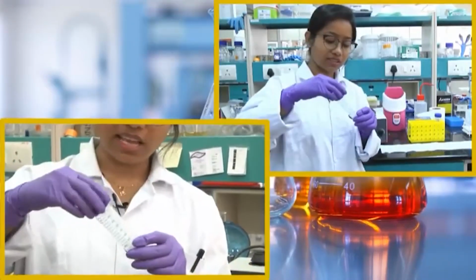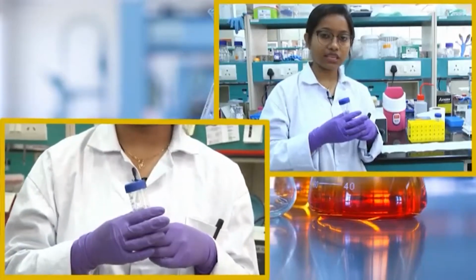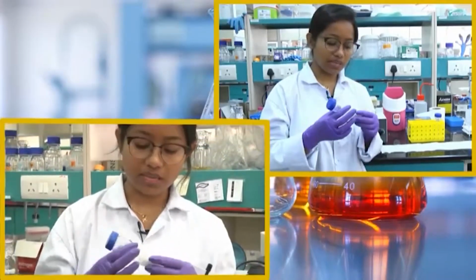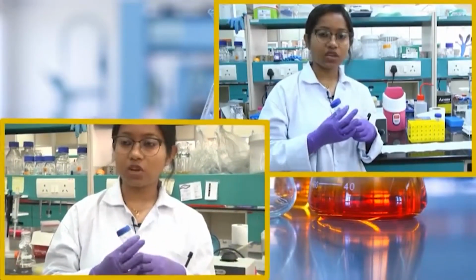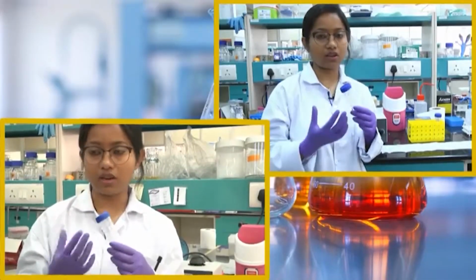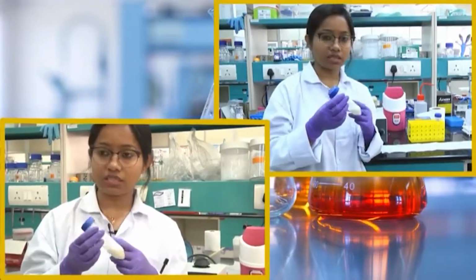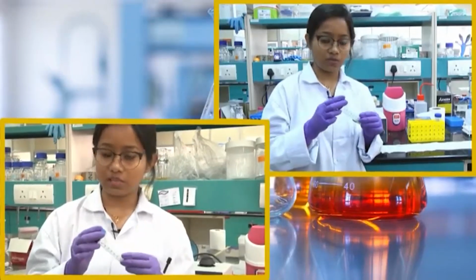Because after the lysozyme lysed the cells, all the cellular components, including the DNA and RNA, come out from the cell, or mainly the nucleus. The DNA is a highly negatively charged and quite large molecule. So those DNA molecules make the solution a lot more viscous, and they try to stick to the wall of this Eppendorf tube, and that is how you know that the cell has been lysed properly.